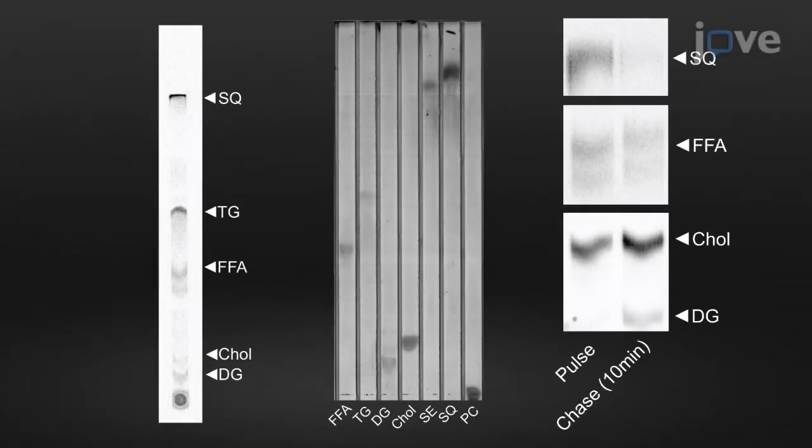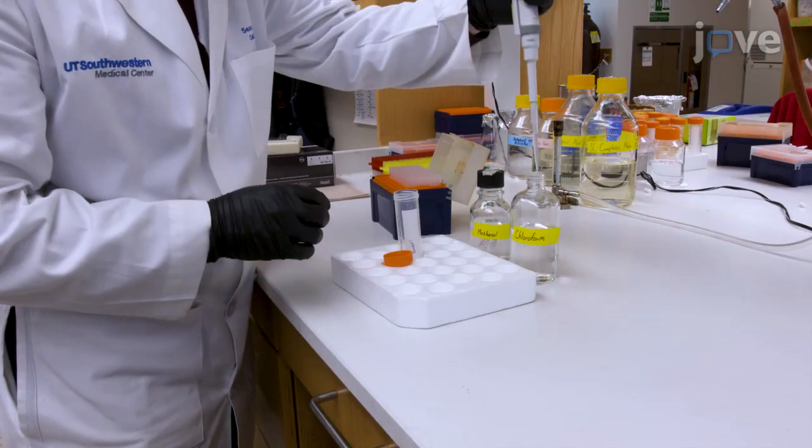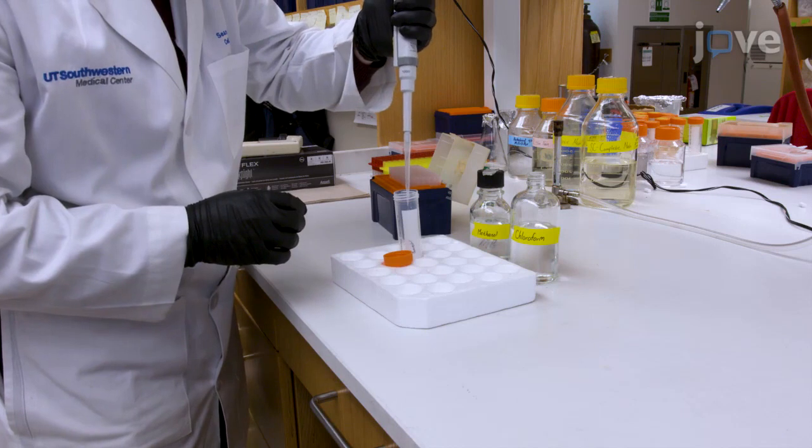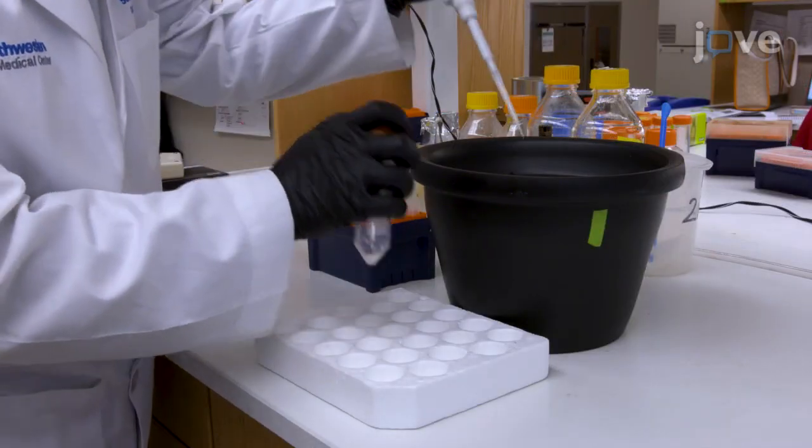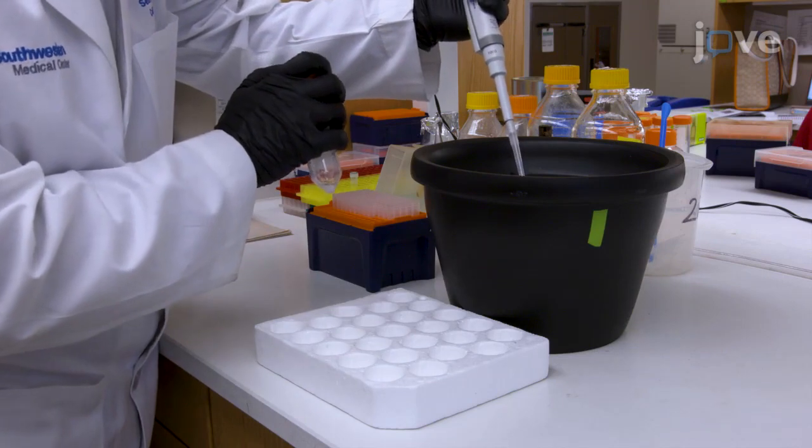This technique uses instruments commonly found in most laboratory environments and allows for the analysis of several samples simultaneously. This method can provide key insights into how lipid metabolism enzymes are regulated in a cellular context and in different genetic backgrounds.